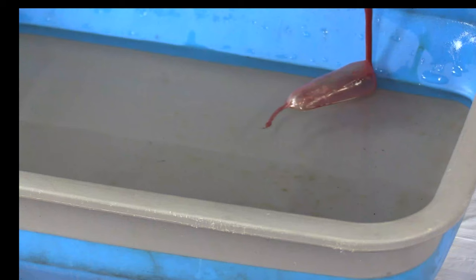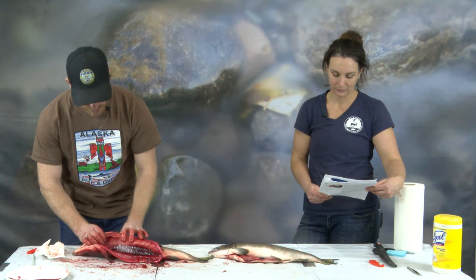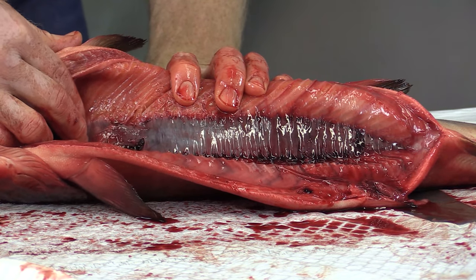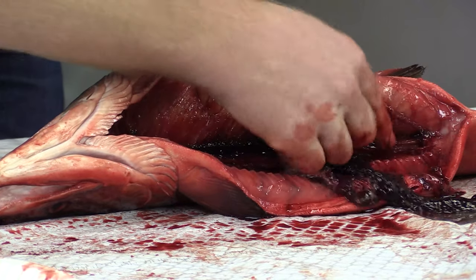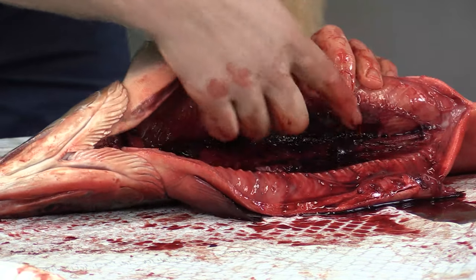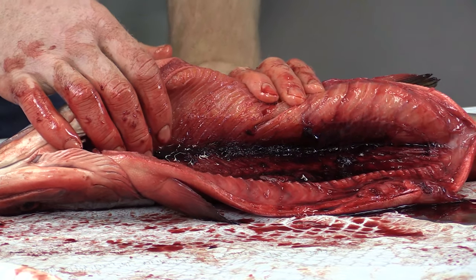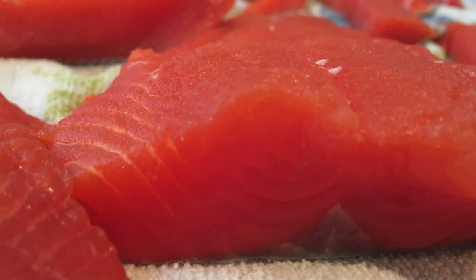If you're able to get the swim bladder out in one whole piece, you can inflate it like a balloon and put it in a bucket of water. Now we're going to look at the kidney. Poke your fingers through and run them all the way down along the backbone to scoop it out — be careful of sharp vertebrae. The kidney has multiple functions: it removes waste from the blood and produces urine. You can also see the rib bones, and between the ribs is the muscle of the fish — the part we flay off and eat.